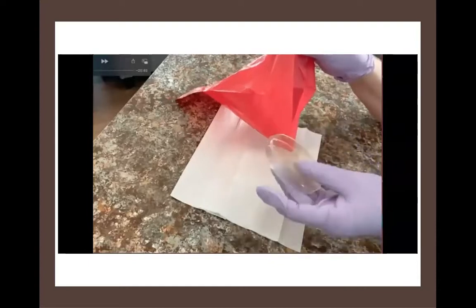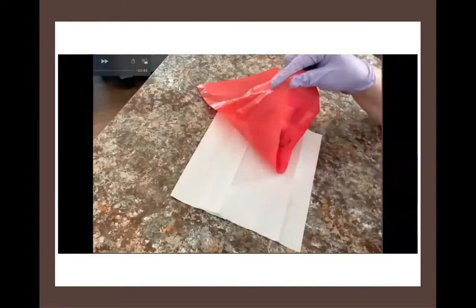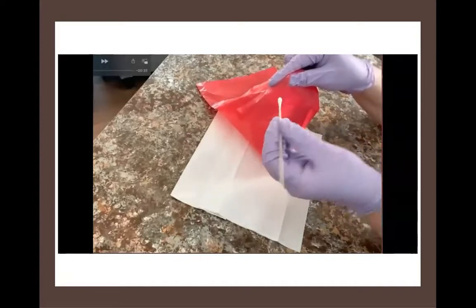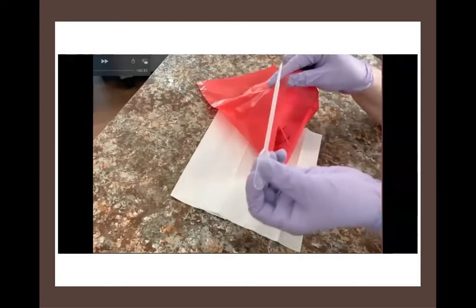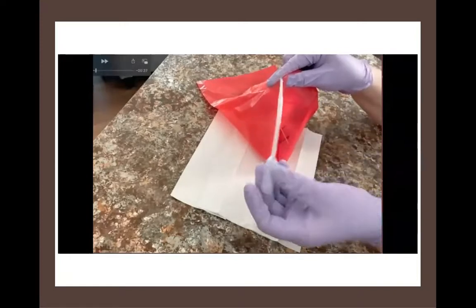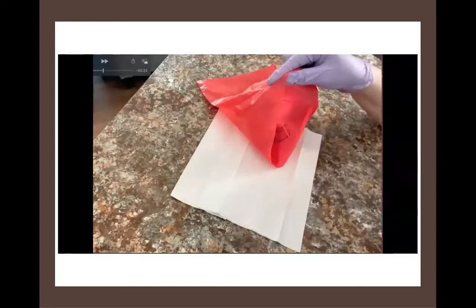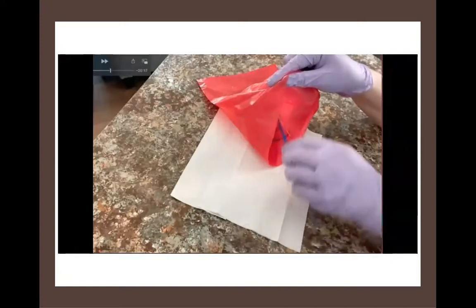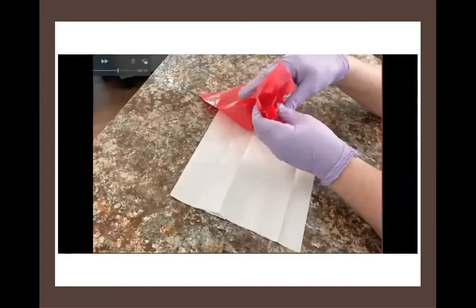So this bag is where we put used culture-related materials, the things that have touched living bacterial culture or microbial culture, our agar plates, our cotton swabs that we might have dipped into culture, our disposable transfer pipettes that may have drawn up culture, the cotton swabs, the hockey sticks, all of these things that have touched living cells that we cannot put in the incinerator because they're disposable.